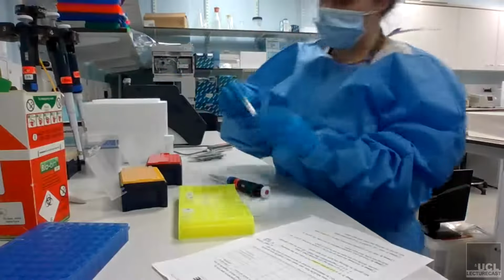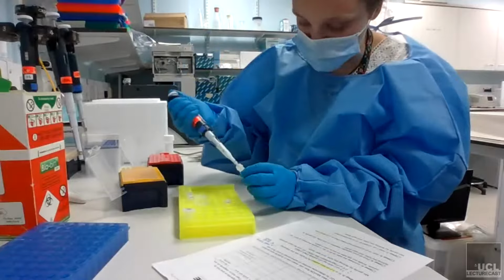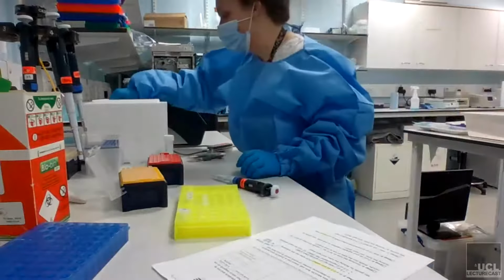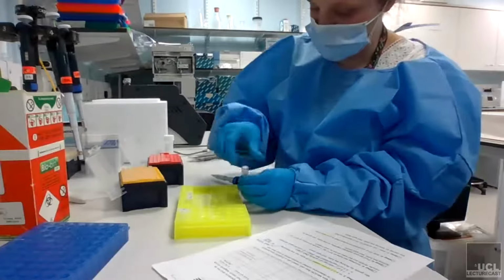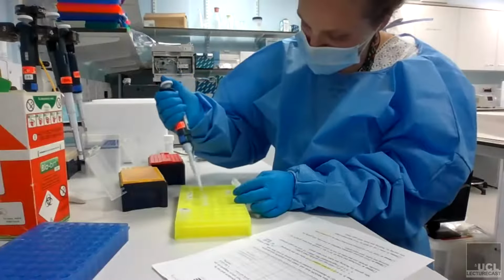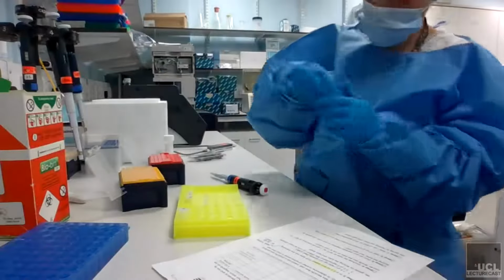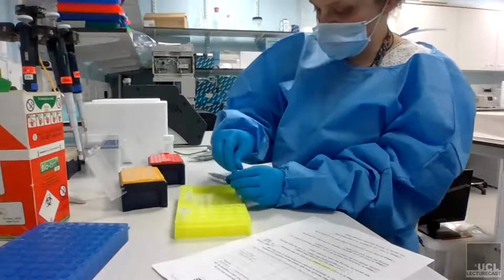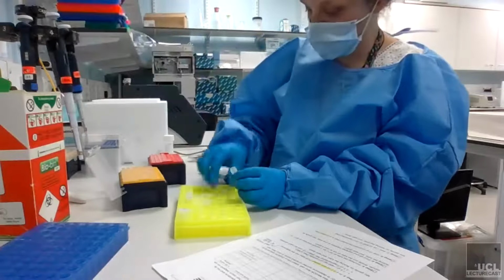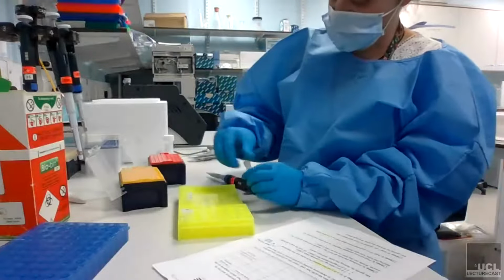So that's sample 1 with barcode 1, sample 2 and barcode 2. You can obviously label them however you wish, but this is my idiot's guide. It's much easier to remember if they're all in the right order. So barcode 3 and sample 3. Barcode 4 and sample 4. And sample 5 and barcode 5.